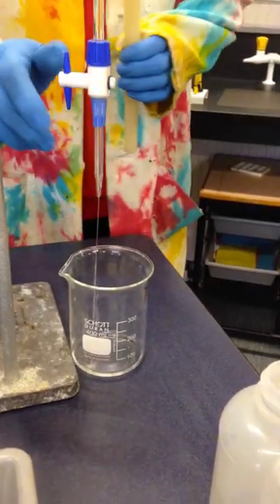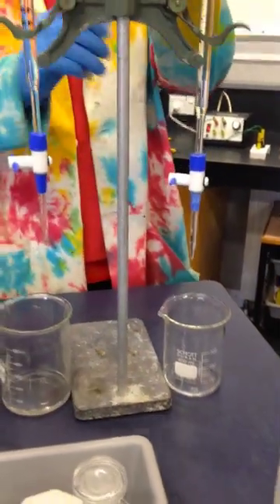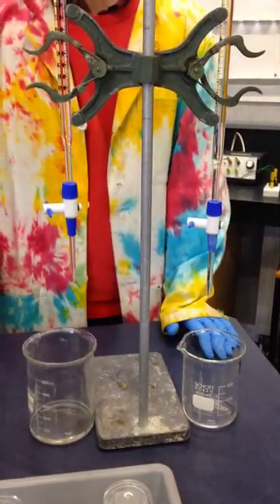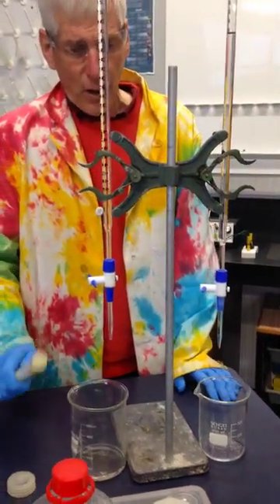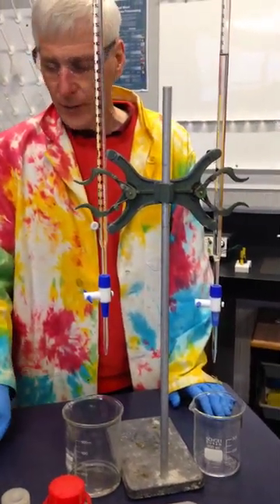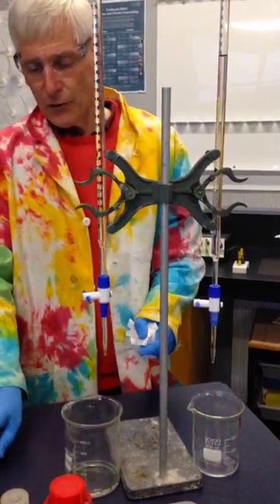So there's a different response here between the water and the hexane with respect to electrostatic charge. And you need to think about what that might be caused by. And we sort of briefly discussed that last Friday.